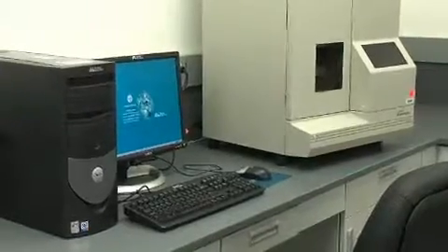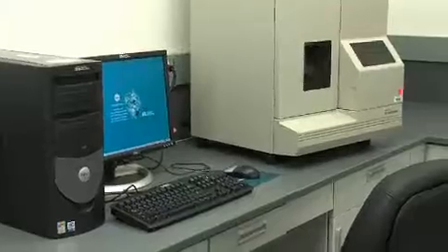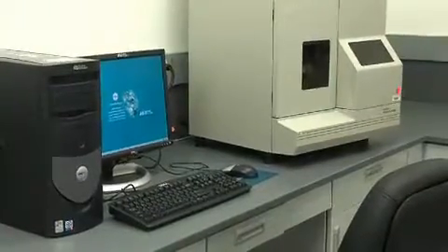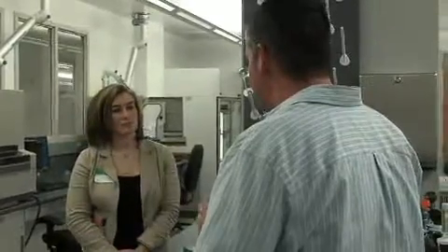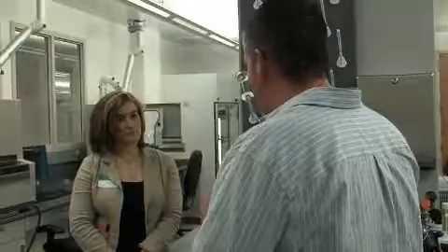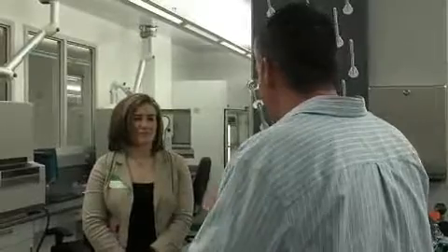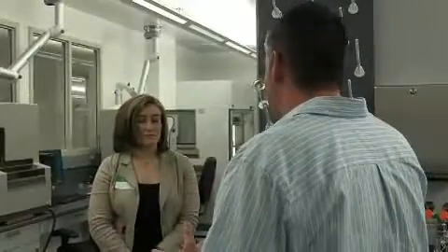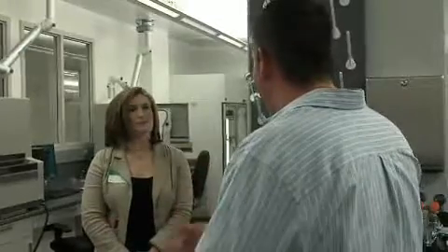Once we've amplified the sample, then we pull it off, we set the sample up and get it ready to go onto the instruments. We actually have a gowning and de-gowning vestibule just for this room. And the reason we do that is because once the samples come in and are put onto the 9700 thermocycler and that sample is amplified, at that point you have amplified DNA. But that DNA has the potential to contaminate other DNA very easily, because amplified DNA can be amplified again easier than regular DNA.